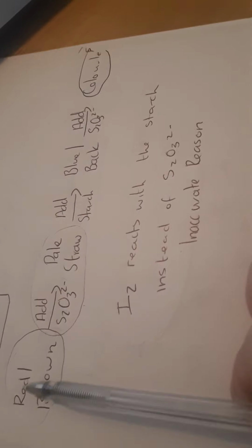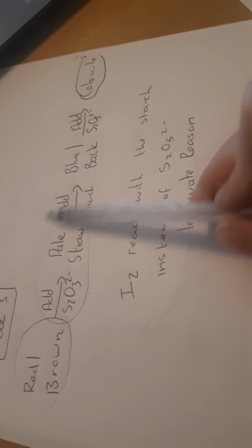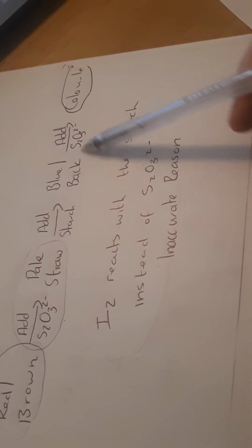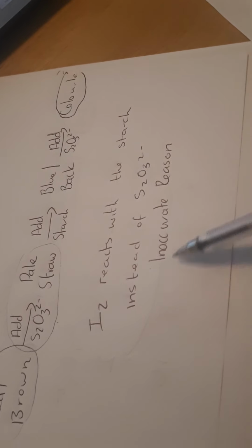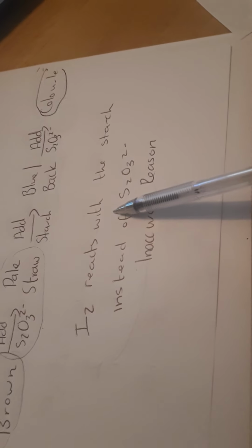The titration figure that you get at the end will be from red-brown to colourless. So it doesn't matter how much of the sodium thiosulfate you add for it to go into pale straw colour. That doesn't matter. Again, always with indicators, we only add a few drops. Again, we only add a few drops of starch here because we want to stop this from happening.